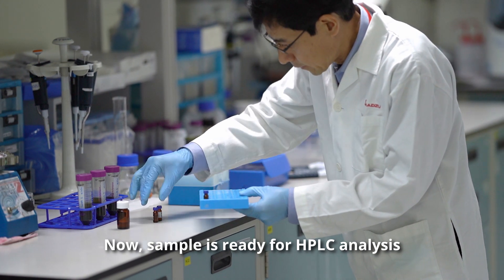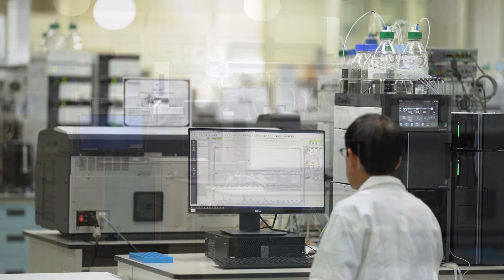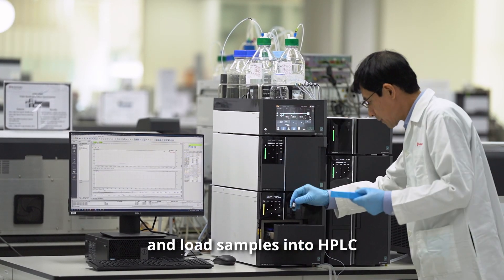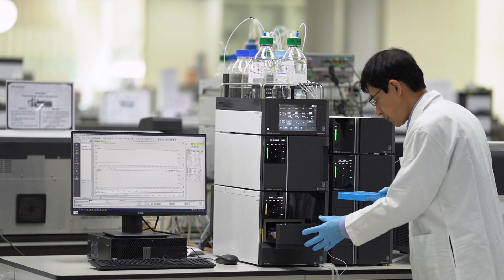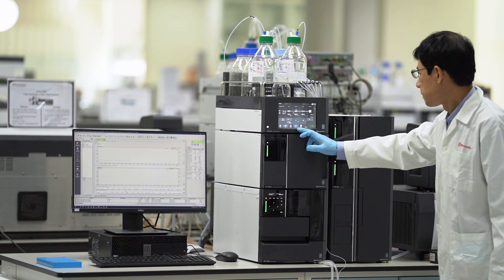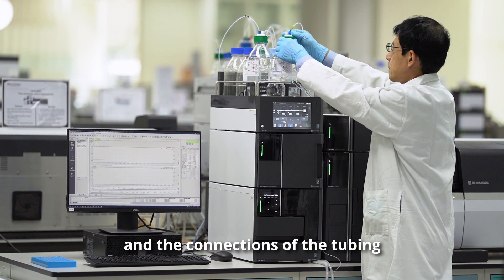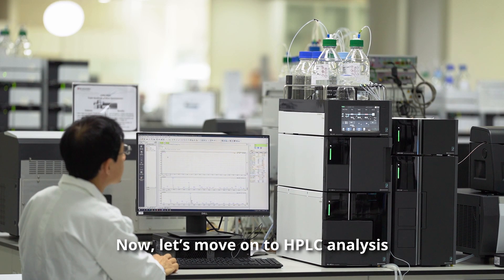Now the sample is ready for HPLC analysis. Open the rack of the auto-sampler and load samples into the HPLC. Check the status of the instrument, the mobile phase, and the connections of the tubings. Now let's move on to HPLC analysis.